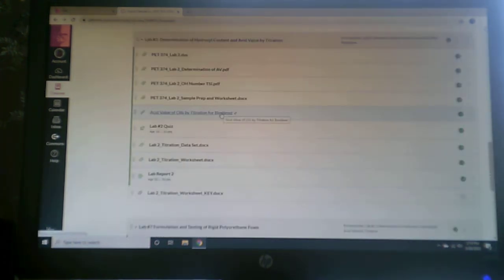There is a short video on acid value of oils by titration for biodiesel. It's under 5 minutes. It gives you a little bit more background. It shows the process of titration, what they mean by a visual endpoint, things like that. And it gives some interesting information about biodiesel and why acid value is appropriate for that. The questions I'm asking on your worksheet really cover why acid value is important for polyols for polyurethane production, but some of the information is also good there.